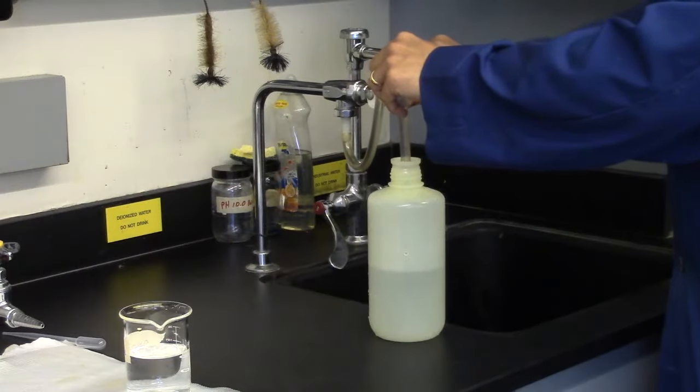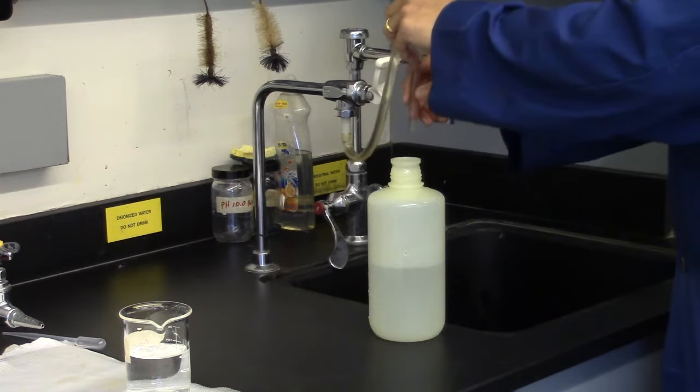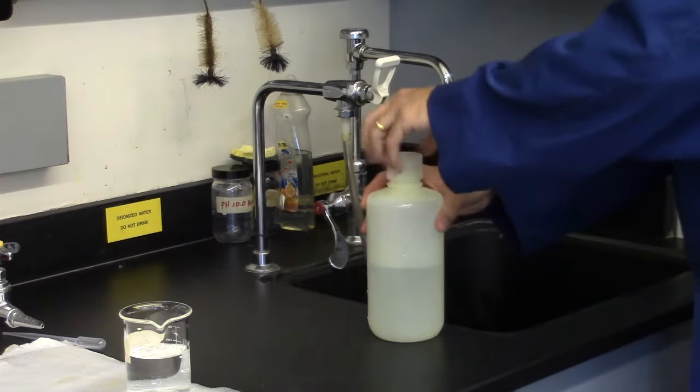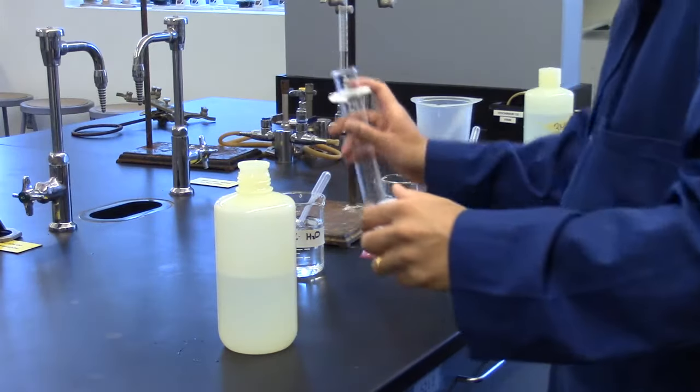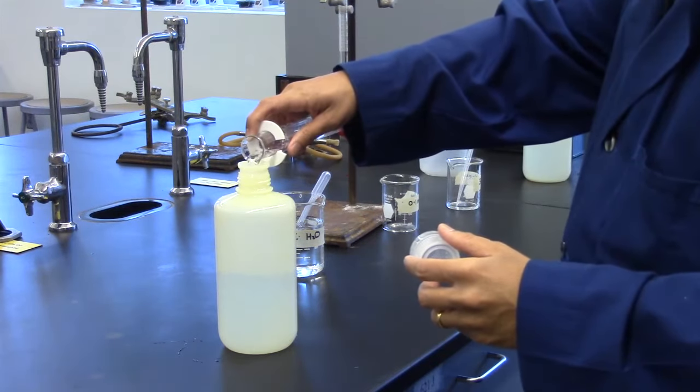To be certain the solution is mixed thoroughly, fill the 1 liter bottle halfway with distilled water. Add the 33 ml of the 3 molar sodium hydroxide to the 1 liter bottle.